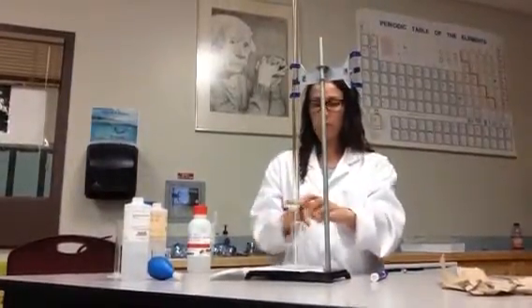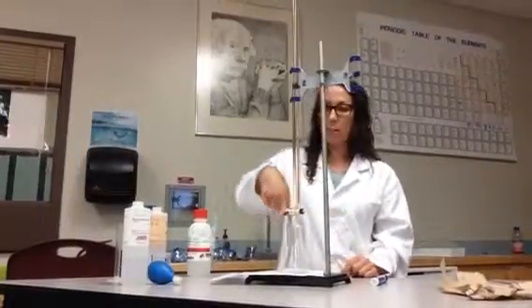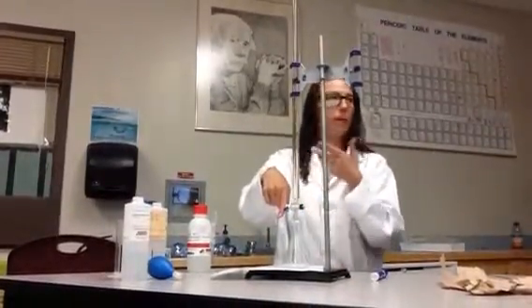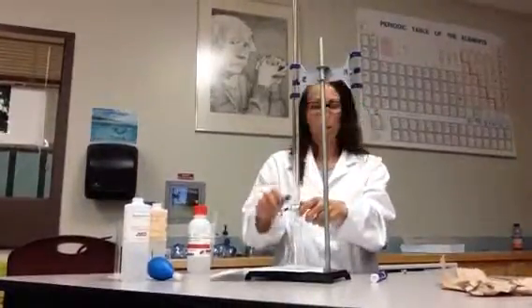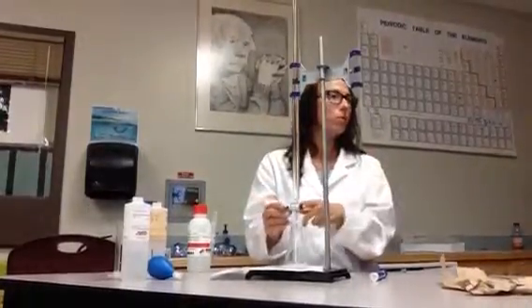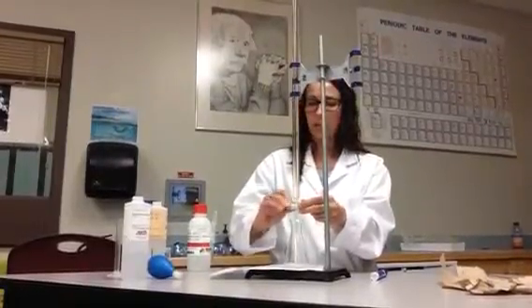Now there's a hole inside here. So if I turn this tap this way, the hole's pointing straight up and down, and I get a flow. If I point it halfway, the hole will be half open, and I'll get half of a flow. So I can control how much I'm adding. Most taps, like your garden tap outside, work under the same principle. You turn it, you open a hole inside that you just can't see.